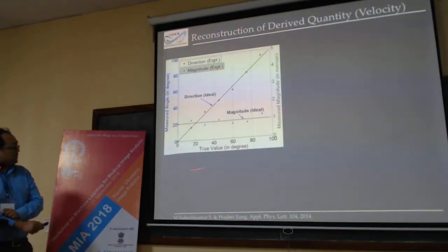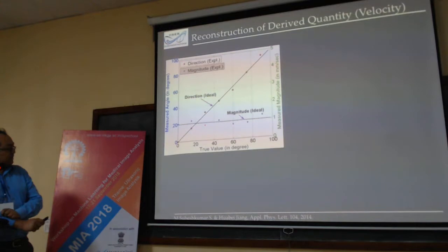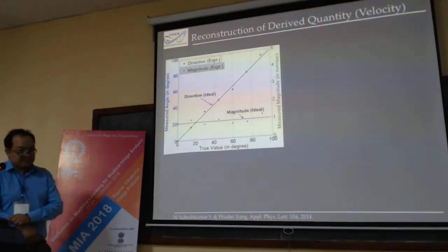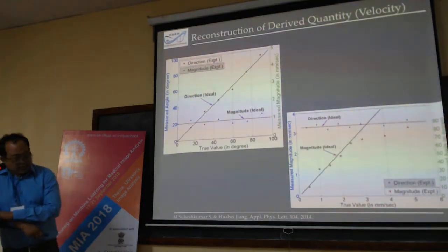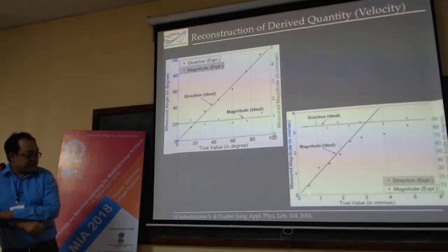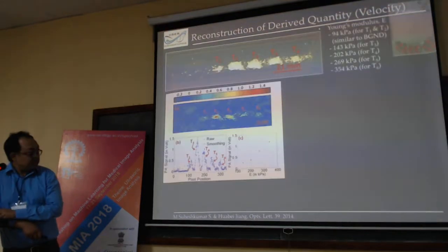This is the comparison of our measured quantity against the true values. At 45 degrees, it should be matching, and it is very close. So this measurement of the magnitude has a limited range. Within it, this modality is successful. Beyond this, it is falling off.